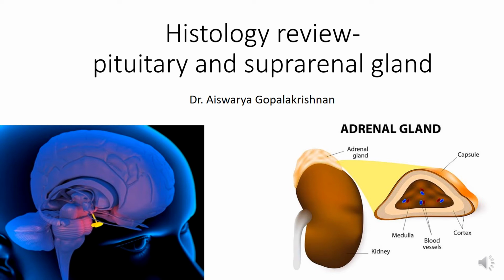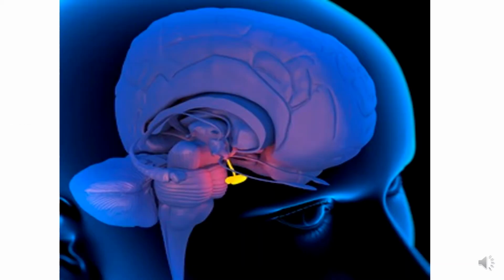Good afternoon. Today we will deal with the histology of pituitary and suprarenal gland. So first we will see the histology of pituitary gland.